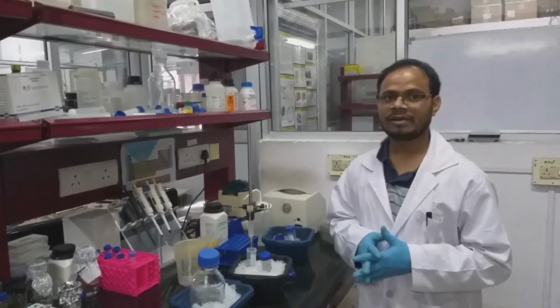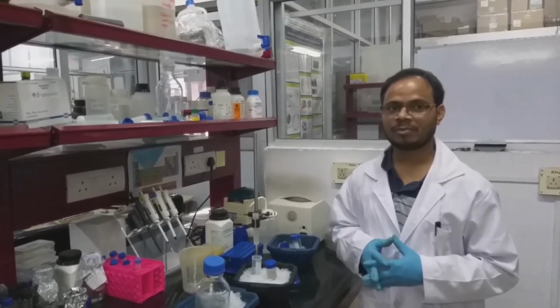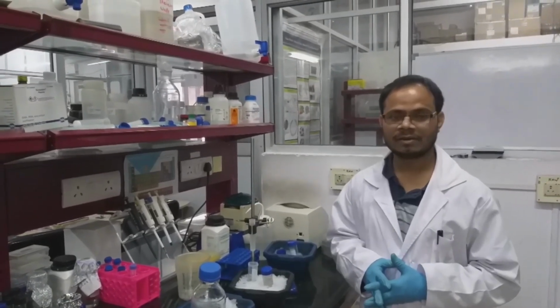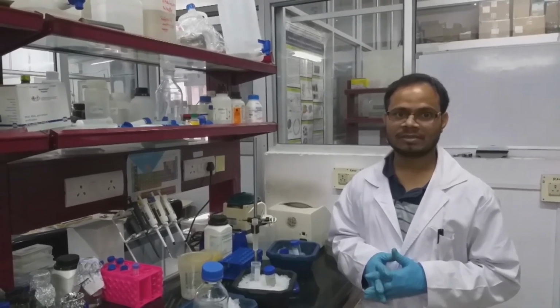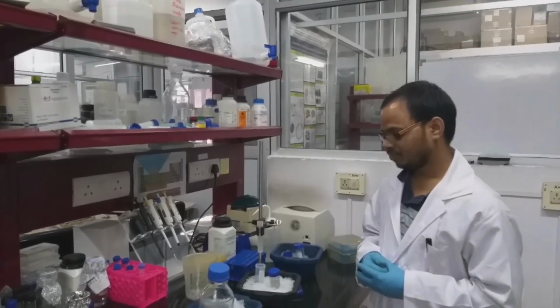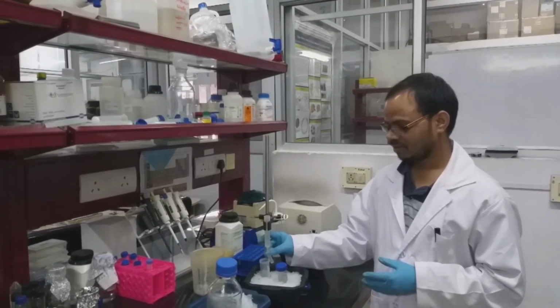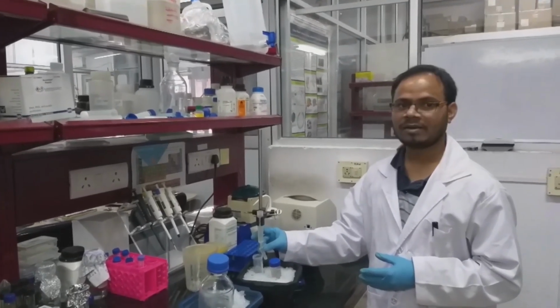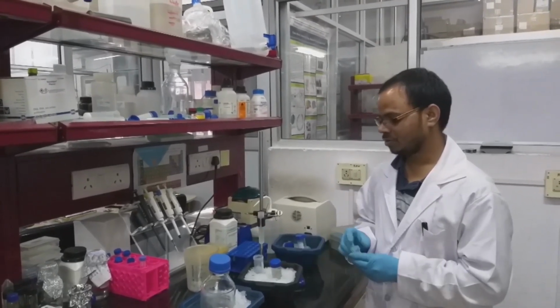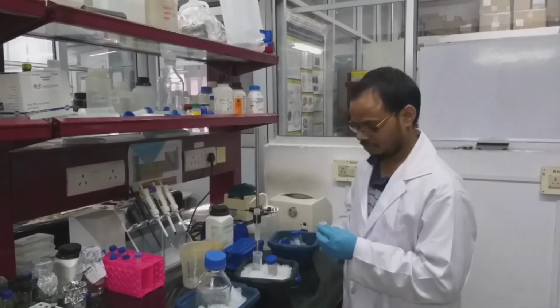Say you are getting only 10% of the protein in your purified fractions and 90% of the protein is eluting in the flow through. In that case you can reuse the flow through for purifying the protein again. So you have to collect the fractions in small microcentrifuge tubes. We have to save those fractions. Label it and save.